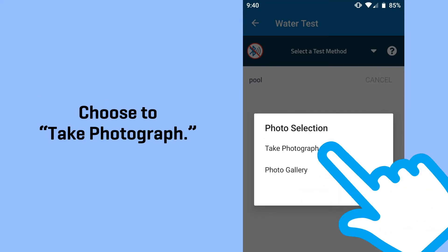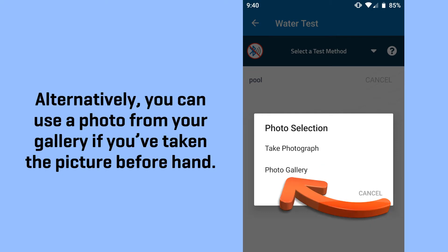Choose to take a photograph. Alternatively, you can use a photo from your gallery if you've taken the picture beforehand.